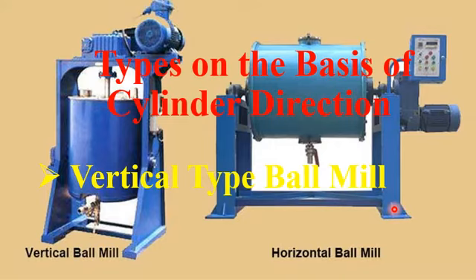It is experimentally proven. I'm not claiming this myself, but it has been proven by different scientists that the vertical ball mill is highly advantageous because of its low power consumption and also its low noise.